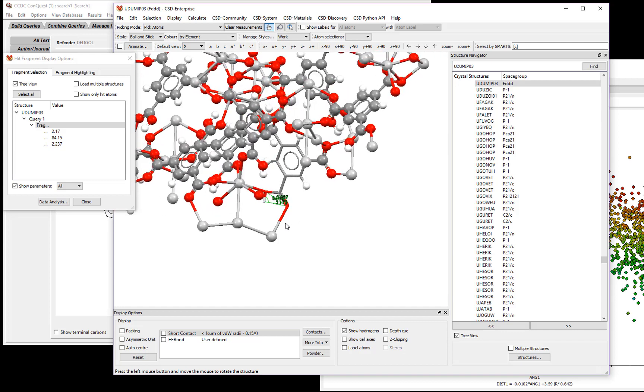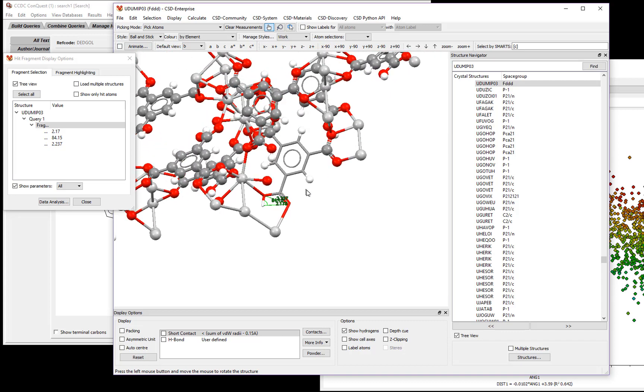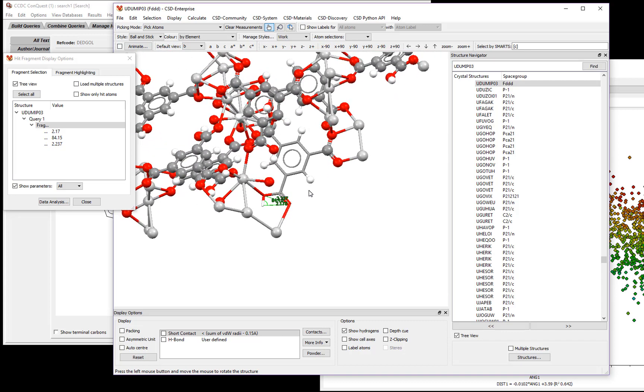So one thing we could have done in our search was we could have limited our search to only organic molecules. We could have also limited our search to make sure that we weren't looking at any oxygen atoms here that were bonded to another atom.